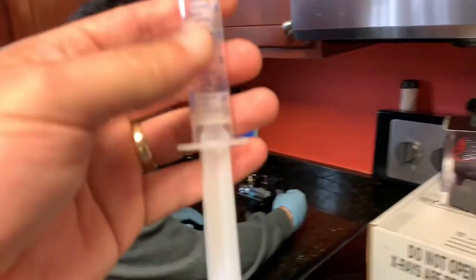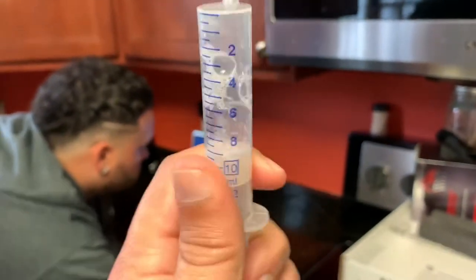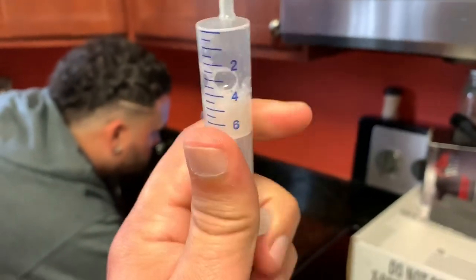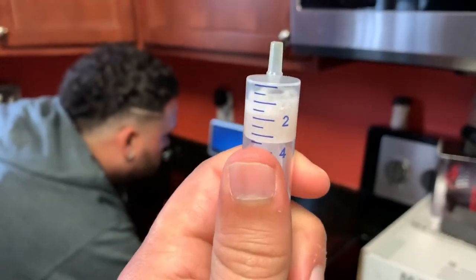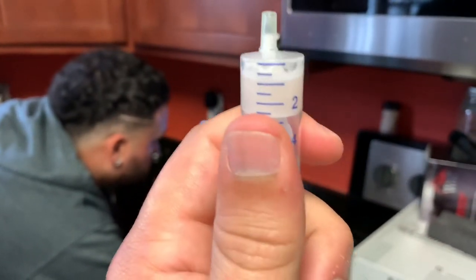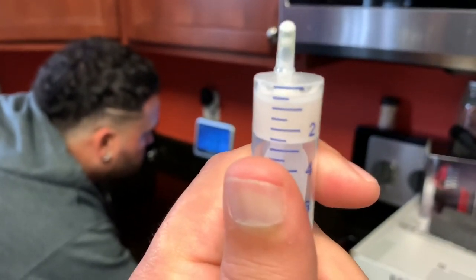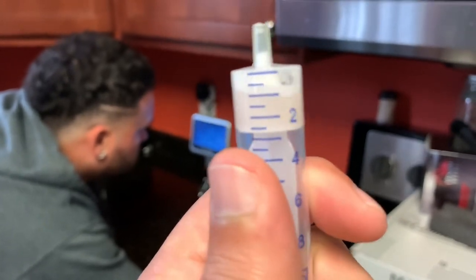All right. So what it gave me here, and you can see. Okay, sorry. You just bring it up to the top so you can see exactly how much semen you got. Now, it shouldn't be this much. You should be spun down way better than that. But my brother is still kind of learning. So realistically, this should be about 1 cc worth of semen, maybe 2 cc's spun down.